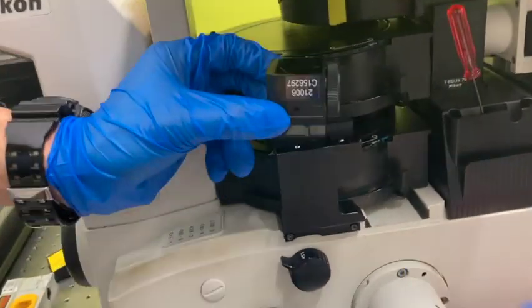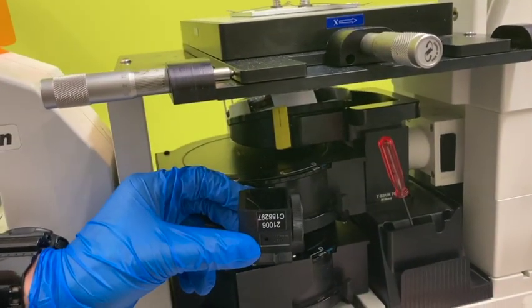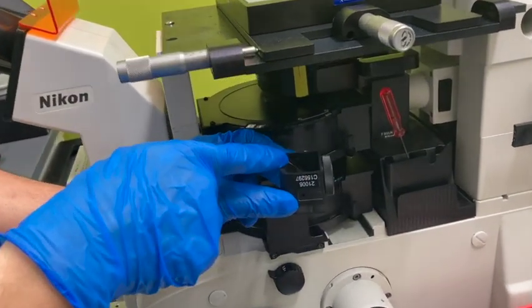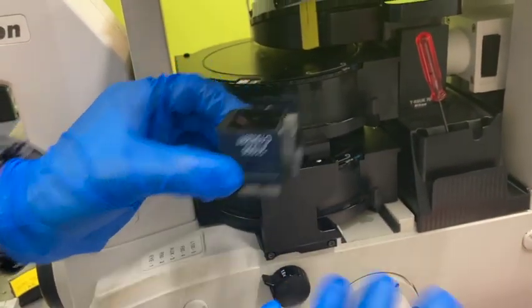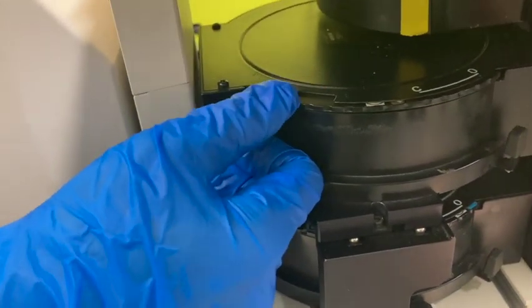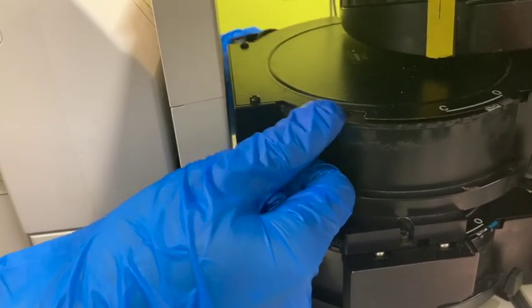So when the green light comes in this way, it will get reflected to our sample, and then both the scattering and the reflection come back, and when they hit this mirror, 90% of the intensity will go through. So that's it. Because we use only this channel for IRM and we never change it, let's put it back.